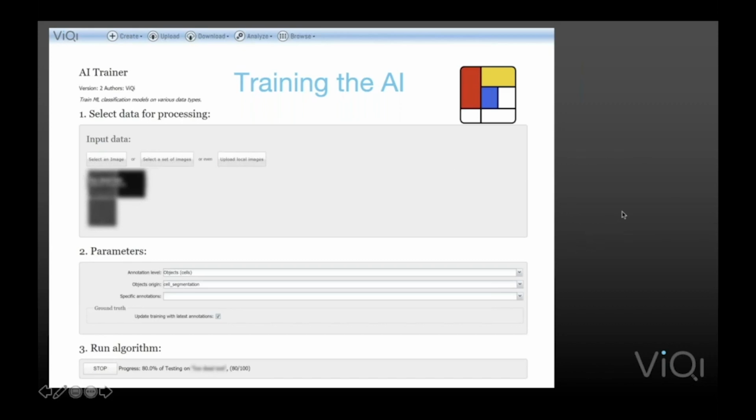With feature-based AIs, they can't, because the number of parameters that you have is fairly small. You can automate the whole thing and have it run through multiple different algorithms and choose them for you automatically based on parameter searches. And so you can have essentially a very, very simplified way of training the AI.